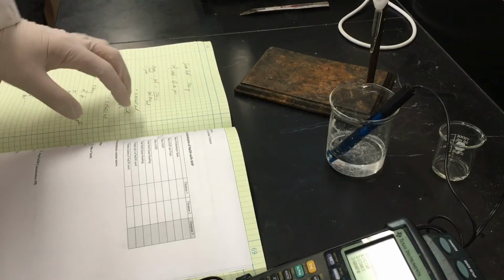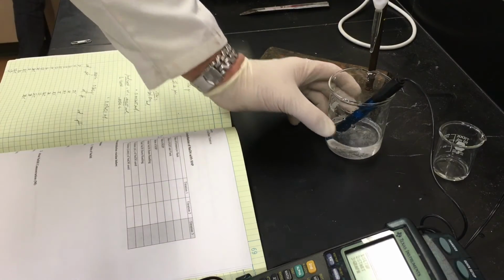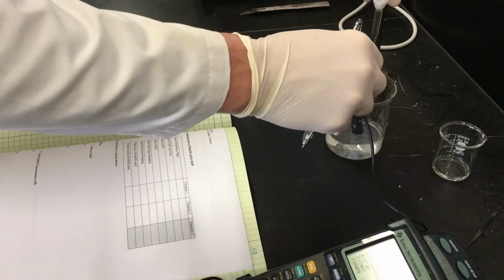So we have calibrated our pH meter, and we are starting our titration curve at the pH of 2.11, and we are adding 2 milliliters of NaOH at a time.